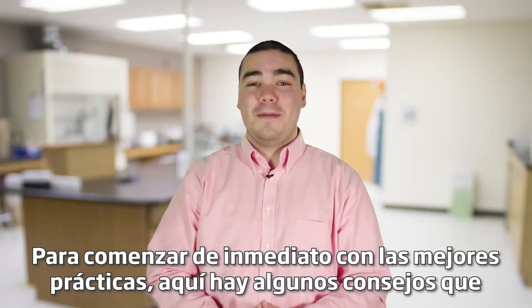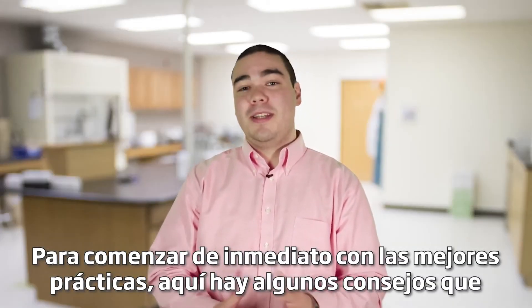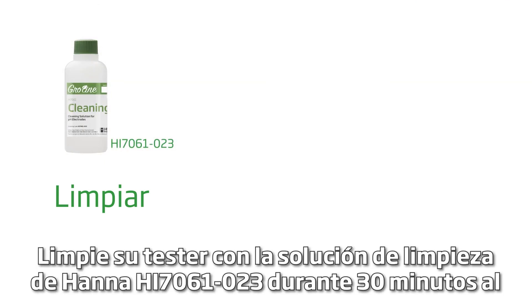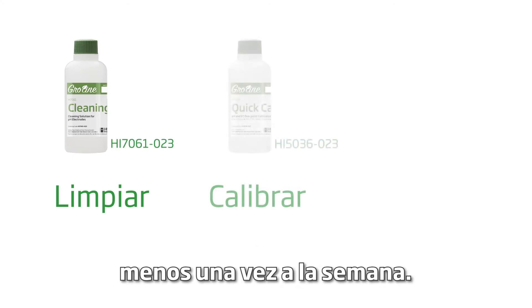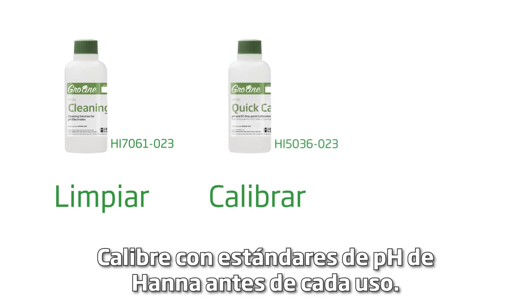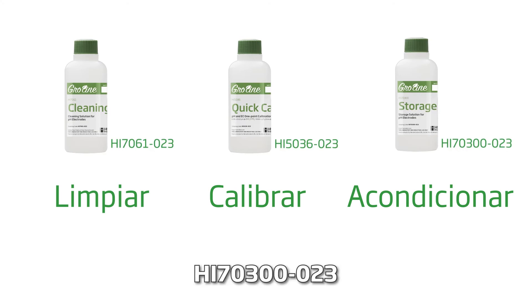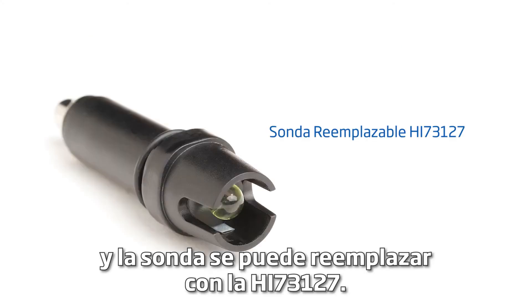To get you started right away with best practices, here are some tips to follow for the best results. Clean your tester with the Hanna HI7061-023 cleaning solution for 30 minutes at least once a week. Calibrate with Hanna pH buffers before each use. Keep your probe conditioned with the Hanna HI70300-023 storage solution. The probe can be replaced with the Hanna HI73127.